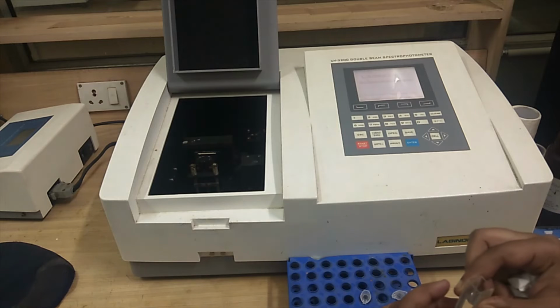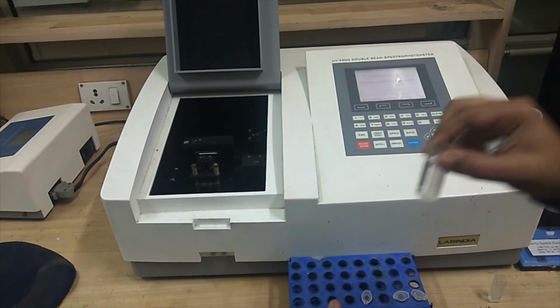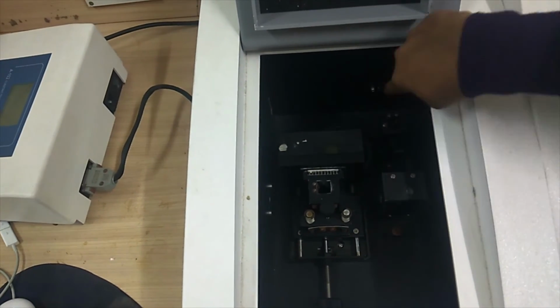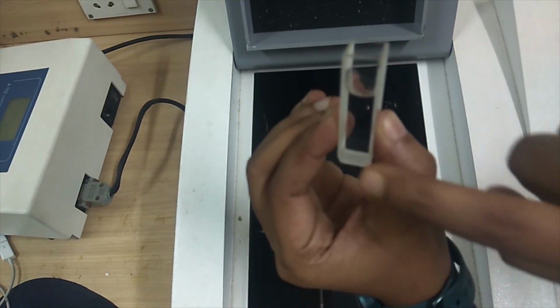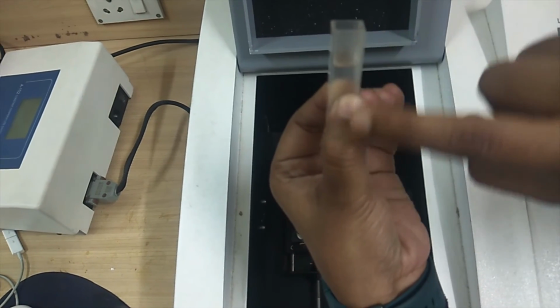Now for putting the samples, initially we will put the two samples. Since the light in this slot comes in this direction, if you look at the cuvette clearly, it has two surfaces. One surface is very transparent, while the other is a little opaque.